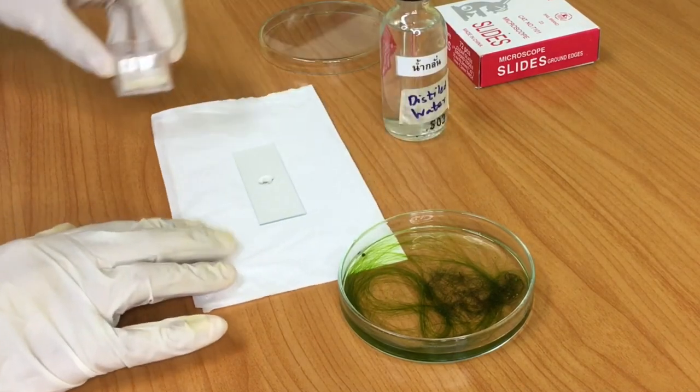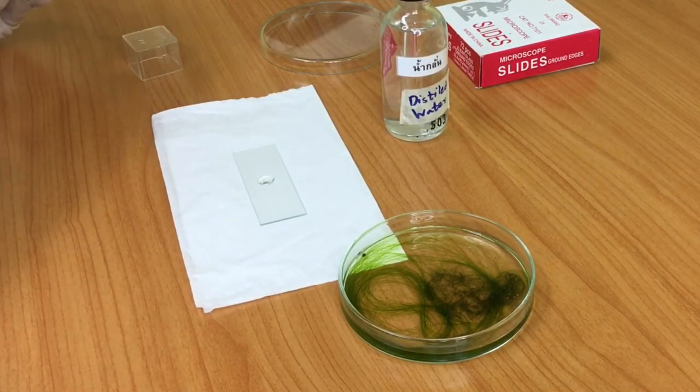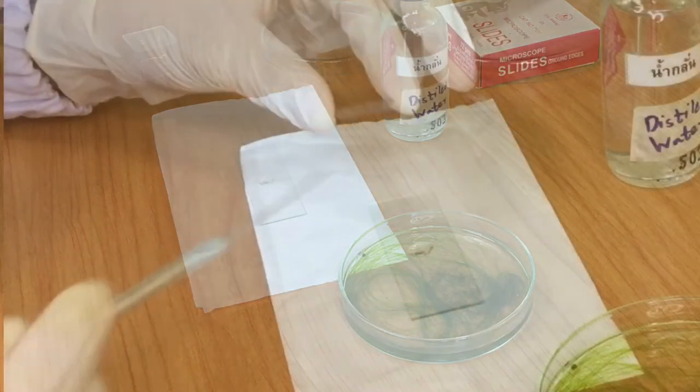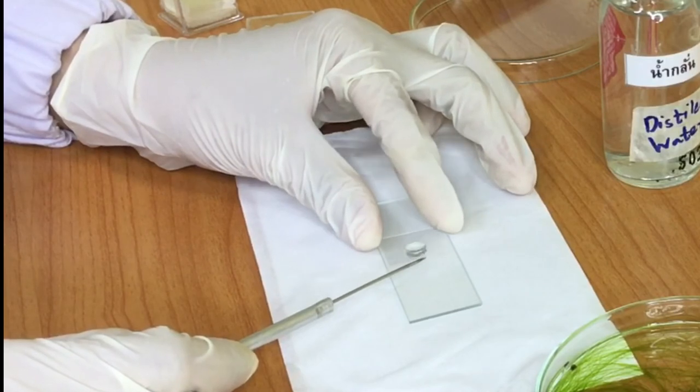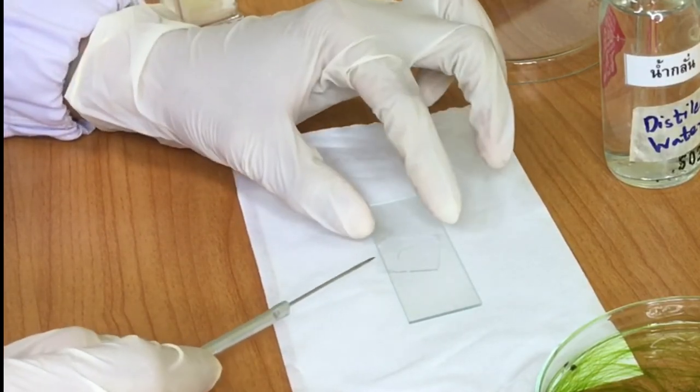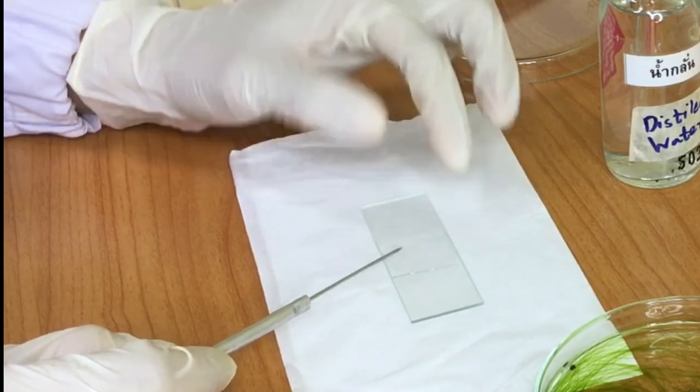Second, add a drop of water onto the specimen on the slide. Then, place a cover slip so that one side touches the water drop. Now, you use the tip of a needle or tips of forceps to lower the cover slip down slowly to avoid air bubbles.